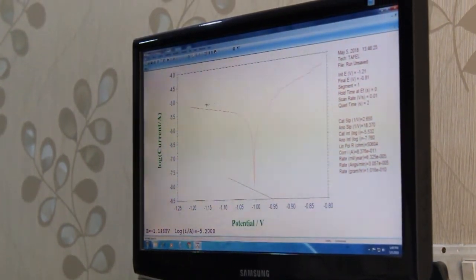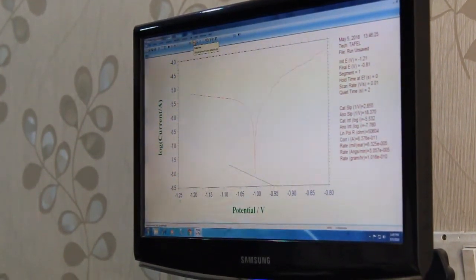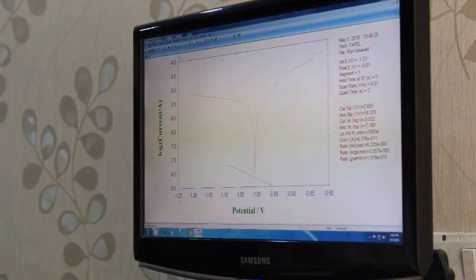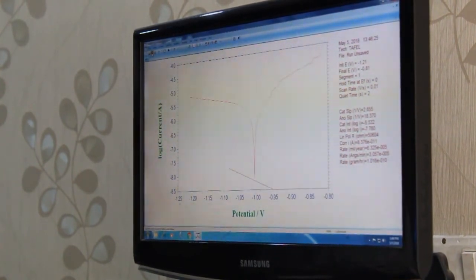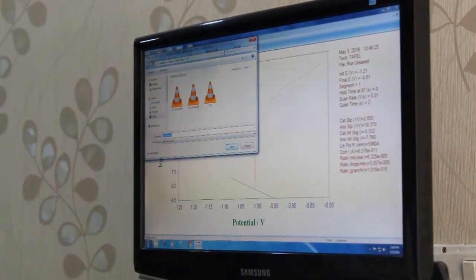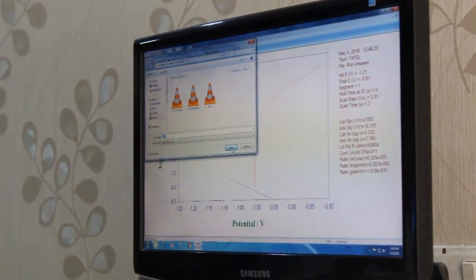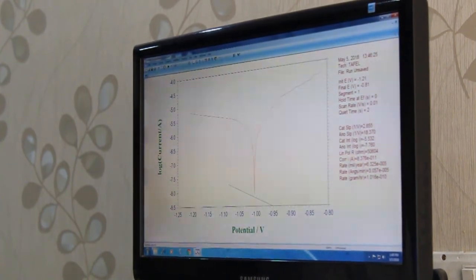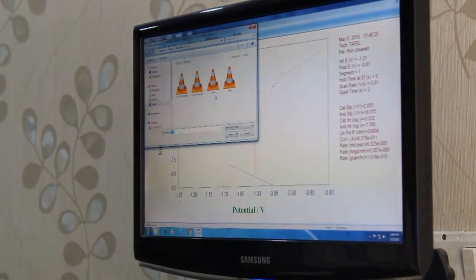I can try now. Yeah, I'm stuck. Right now I cannot do the stress analysis. First I will say this one is Tafel, and say I do not like the noise in the measurements. Still I go for the overlay and plots.